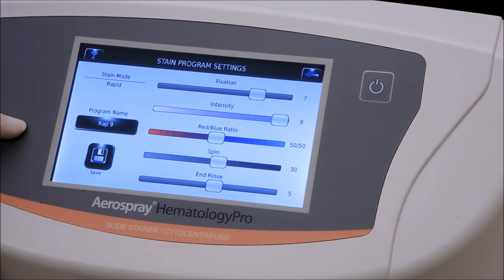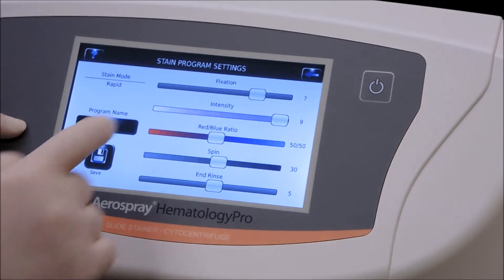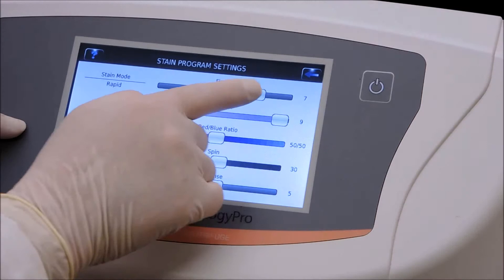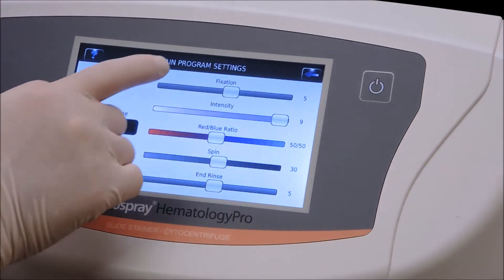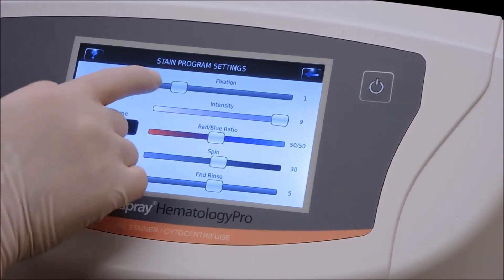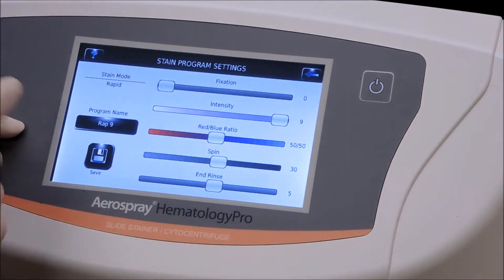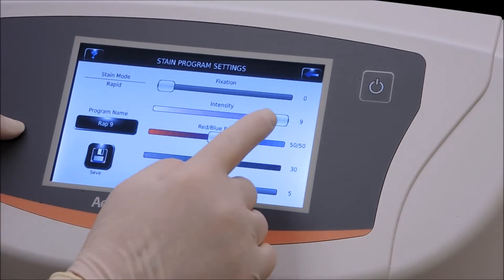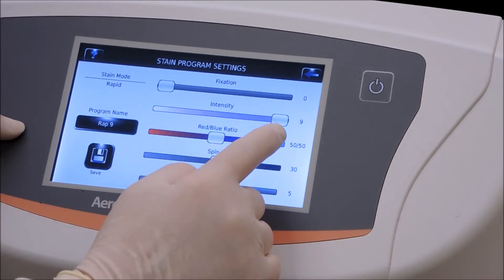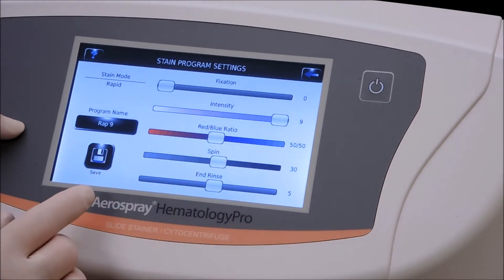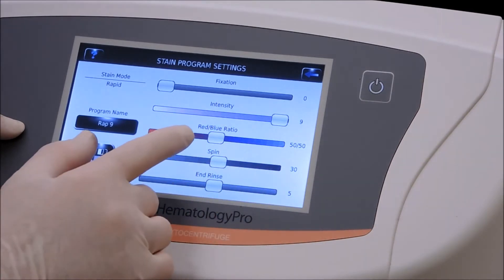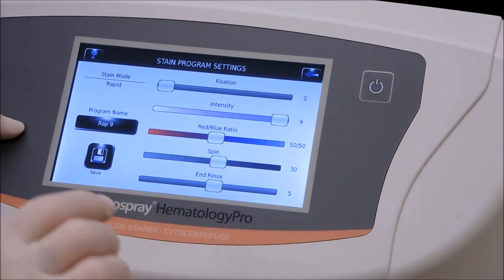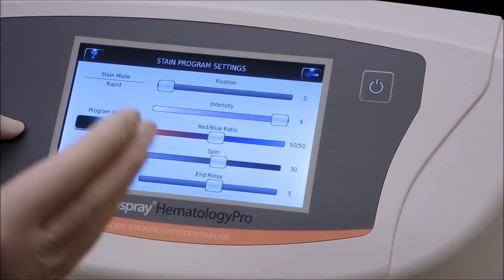We'd like to make some modifications to this program to save time. We can turn the fixation all the way down to zero — it'll save time since we won't need to use that methanol. Working through the settings, the intensity stays at nine, which will move the valves back and forth.